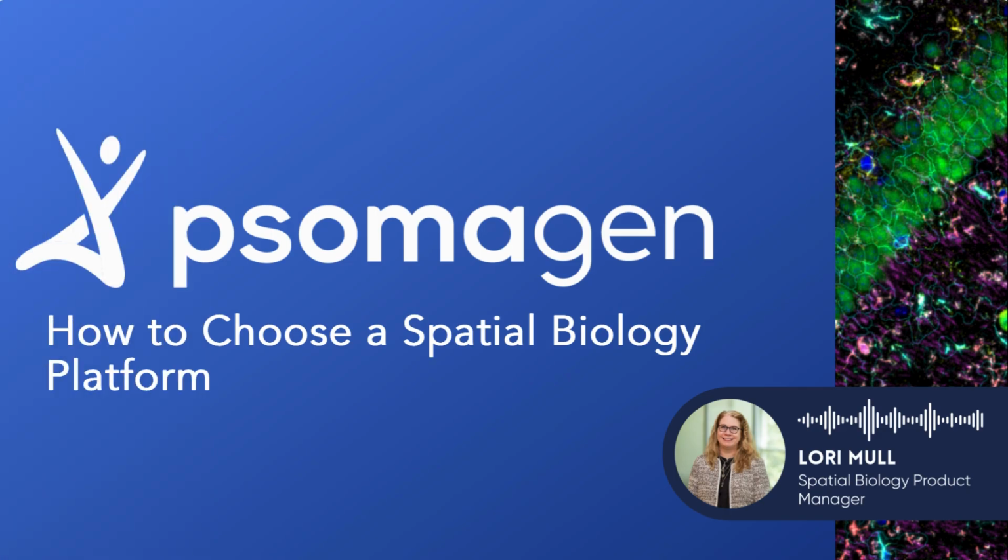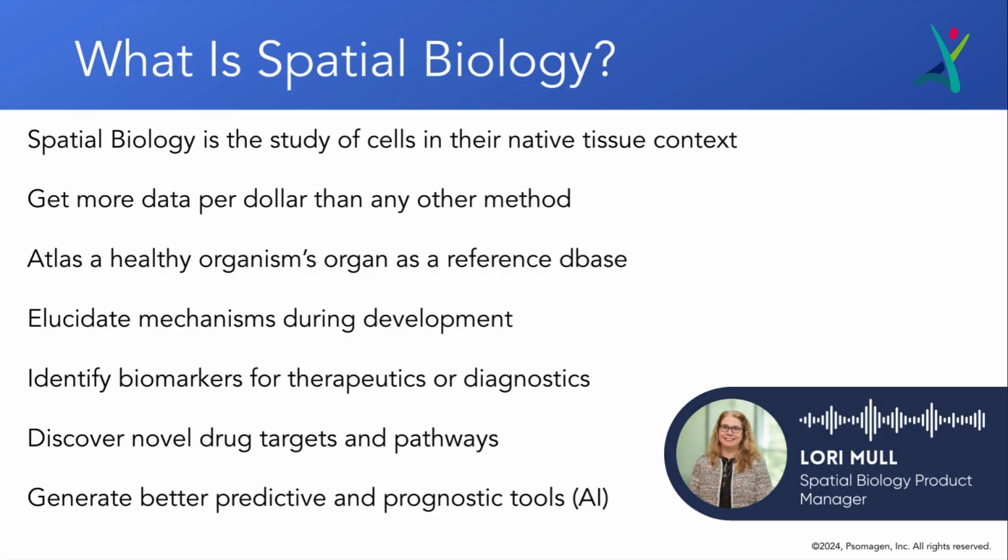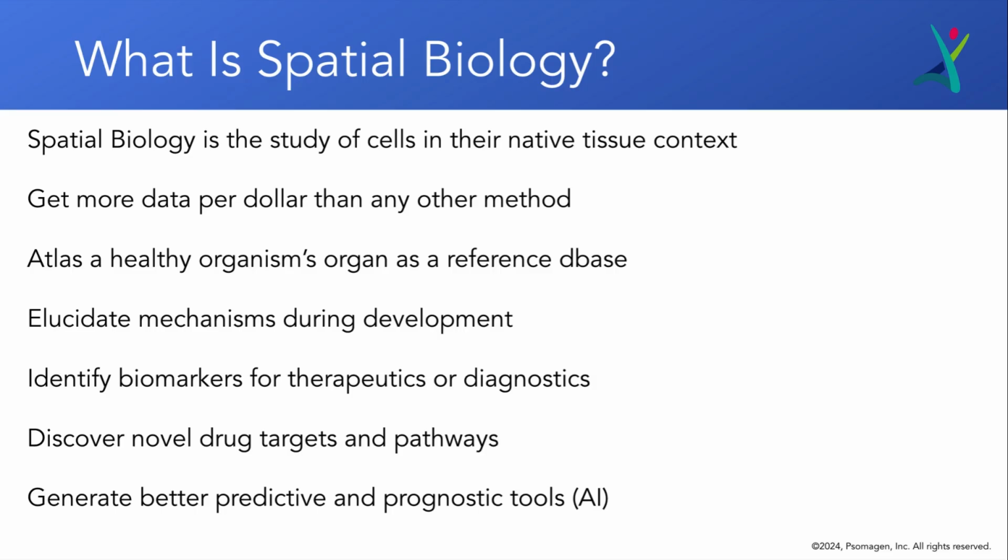Welcome to How to Choose a Spatial Biology Platform. Spatial biology is the study of cells in their native tissue context, and it was originally invented in 2019. Since then, it's been widely adopted by many fields such as oncology and neurology.